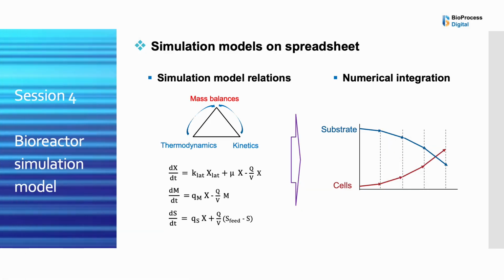Additionally, you will learn how to numerically integrate the differential and algebraic equations that govern the time-dependent changes in cells, substrates, and products concentrations using a spreadsheet.